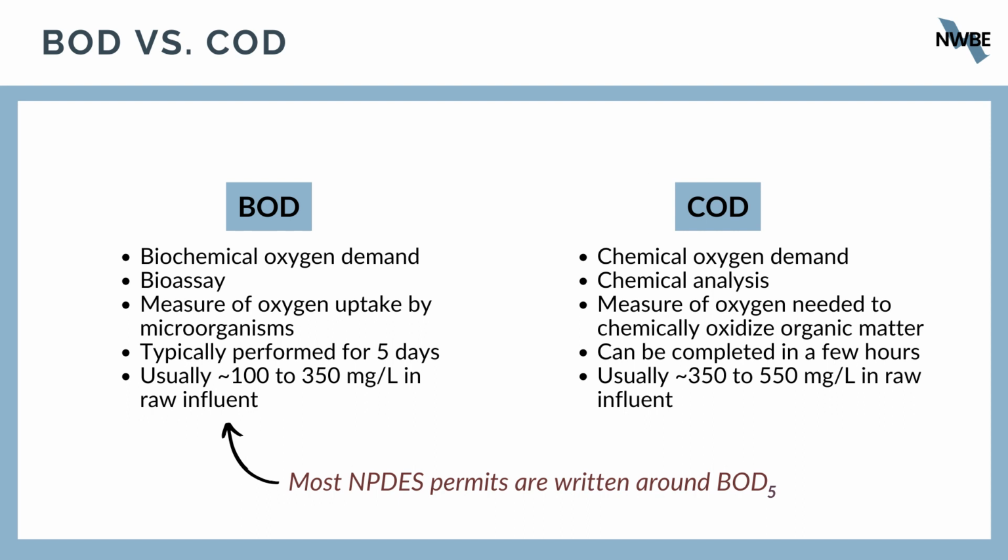Not surprisingly, given their names, BOD is a bioassay while COD is a chemical assay. The BOD bioassay involves starting with a known amount of wastewater, spiking that wastewater with what are called seed microorganisms, and then storing the sample in the dark for 5 days at 20 degrees C. The dissolved oxygen in the sample is measured at the beginning of the analysis and after the 5-day incubation period, and the difference between the dissolved oxygen at the start and the end of incubation is used to calculate the BOD.